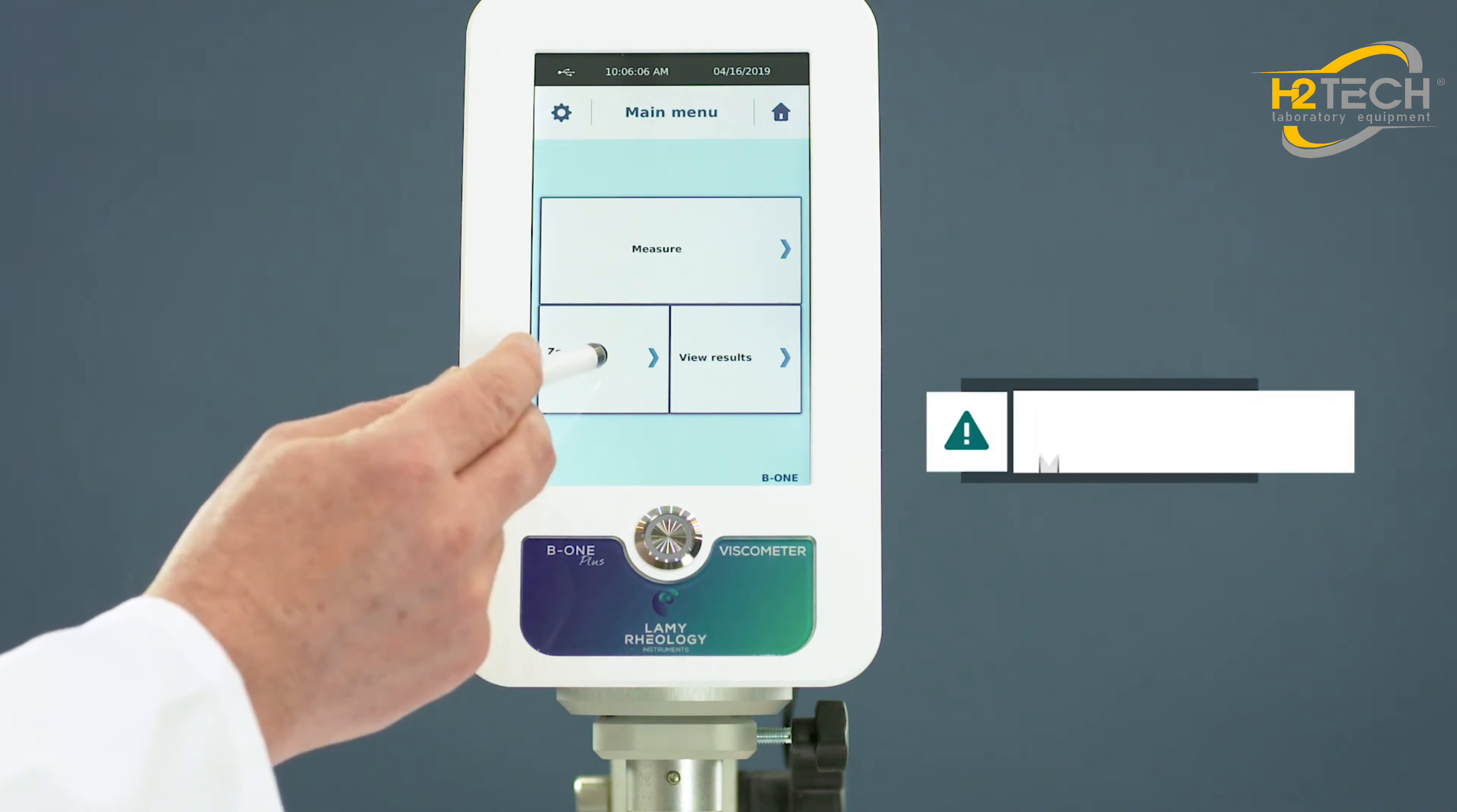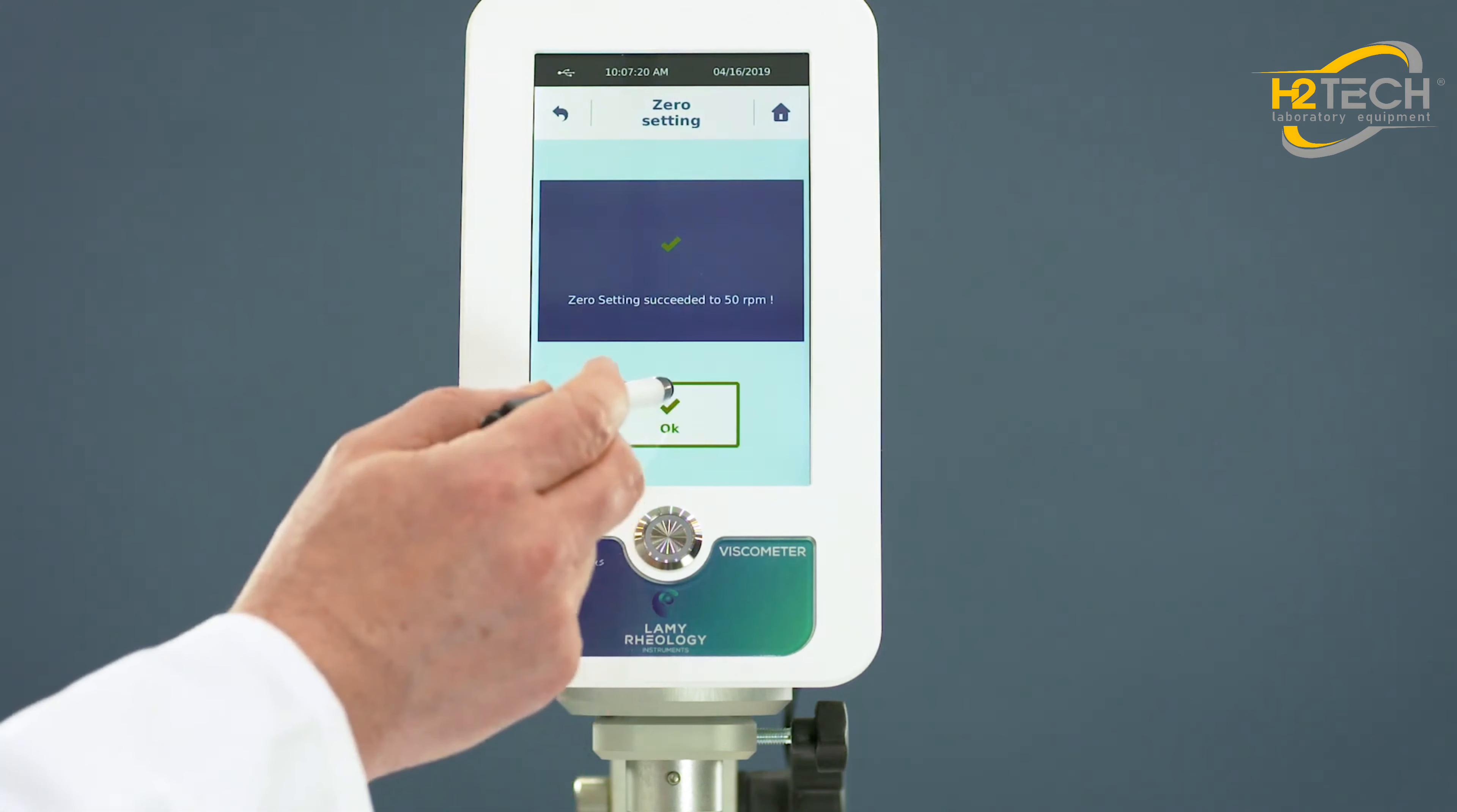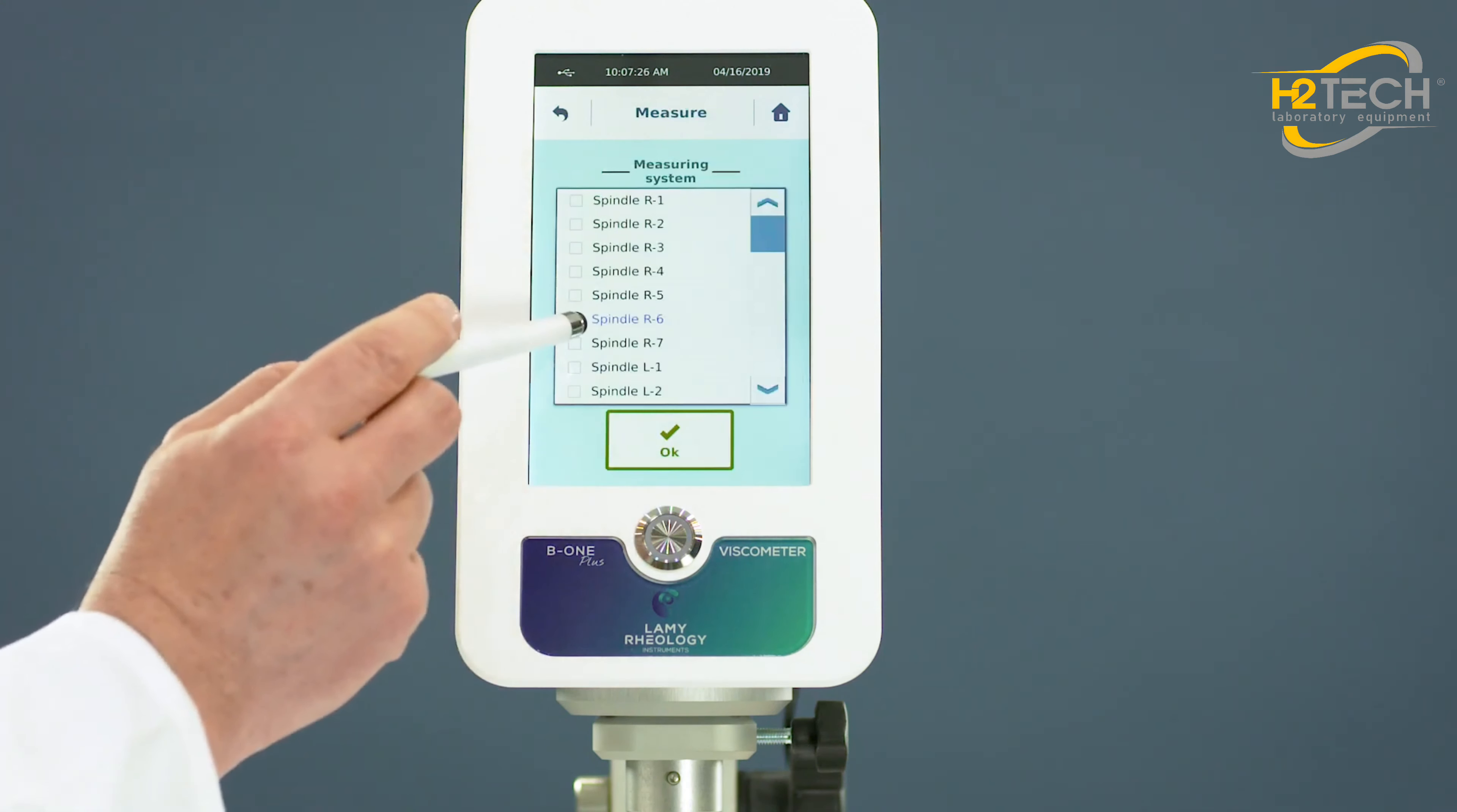Zero the device. You should make it at least once by day. You can now set your measure. Choose the spindle, the speed and the duration.